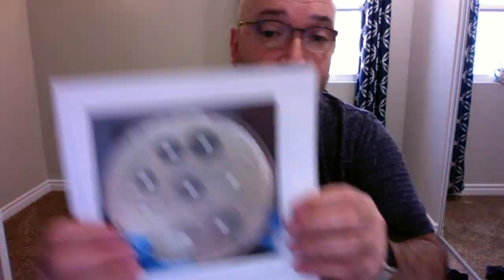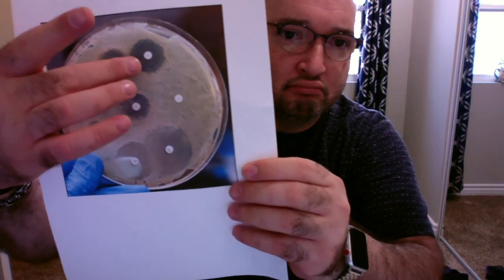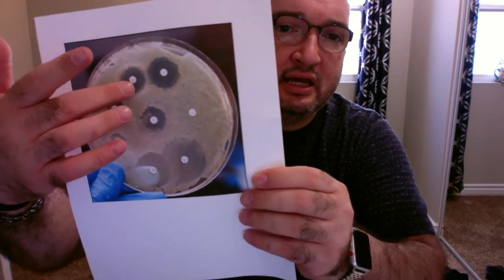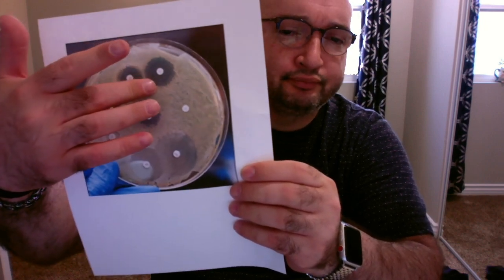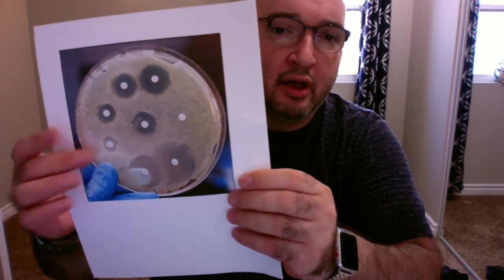But what I was looking to see or hoping to get was something like this. That white area is the lawn, and then those areas where you can pretty much see through the plates, around the antibiotic disc, indicate microbial inhibition. So whatever these antibiotics are do inhibit the growth, and then further and further out, they don't.